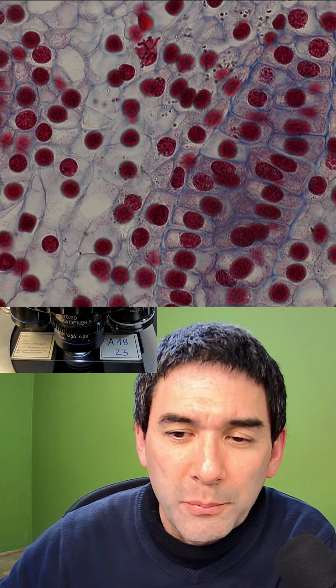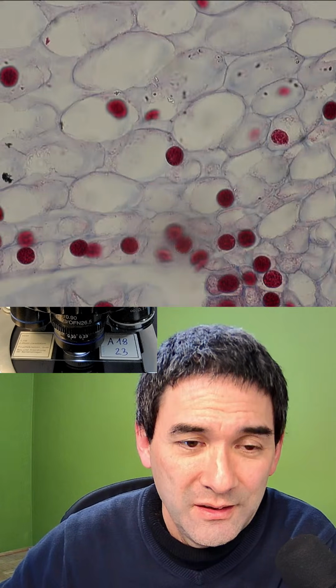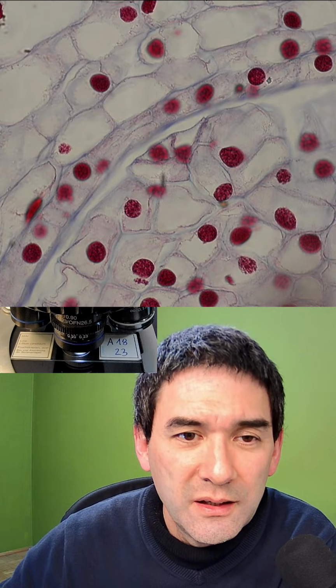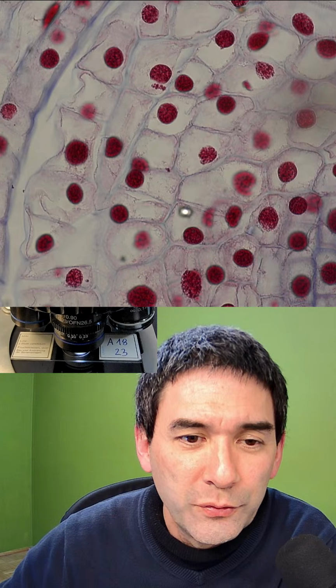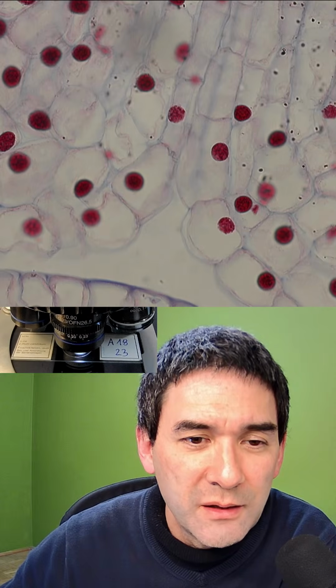Fetal development is a long sequence of emerging properties dictated by gravity and chemical concentration gradients. Yes, and it's a complex process. They've been studying developmental biology also on fruit flies and Drosophila. Here again, you see that that's one of the nice, how do you say, specimens.